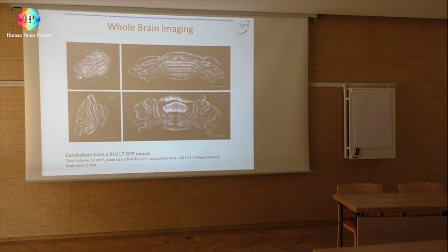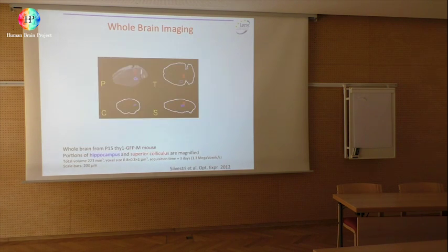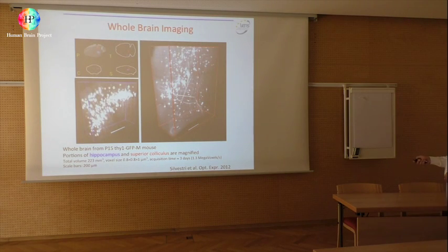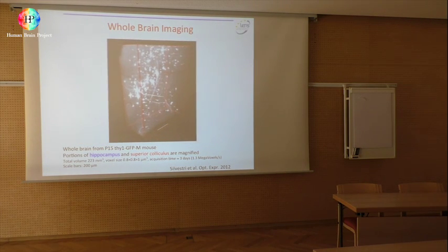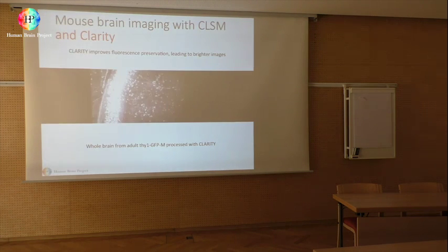This is about 10 terabytes of data. This is, for example, cerebellum. But the nice thing is that you can zoom in on one region, okay? And then you can follow, for example, processes in one area of the brain and track processes, even millimeter-long processes, from one area to another area of the brain.